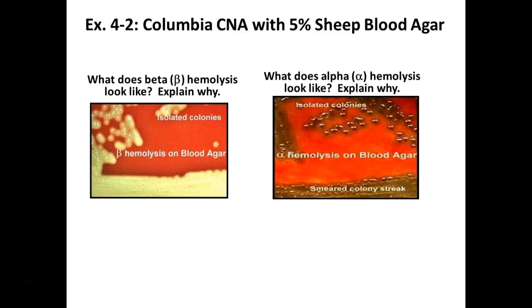Anyone else? You have nothing. Okay. Oh, you don't have bacillus if you're at the front tables. Yeah. Nobody at the front tables probably has hemolysis, right? Yeah.